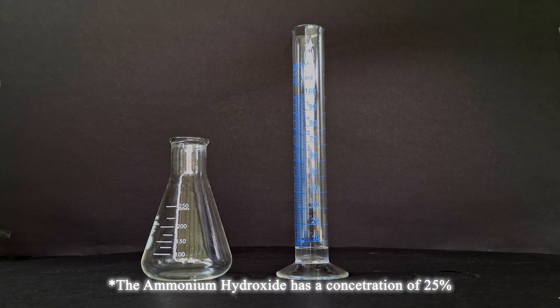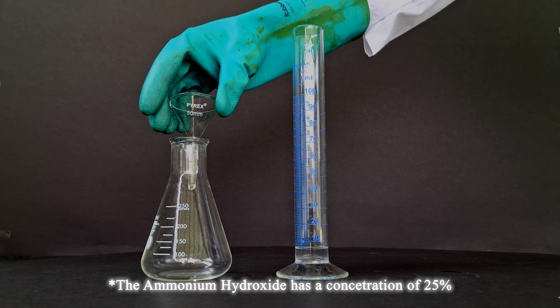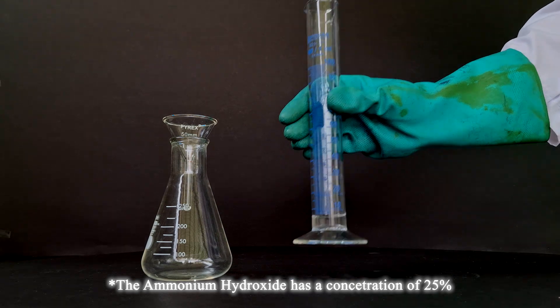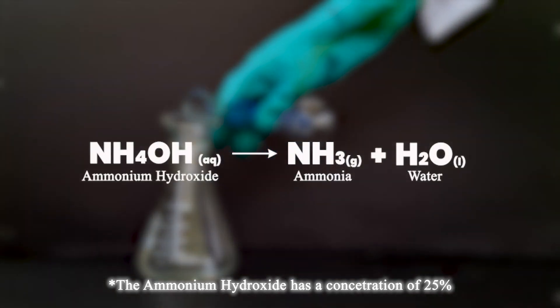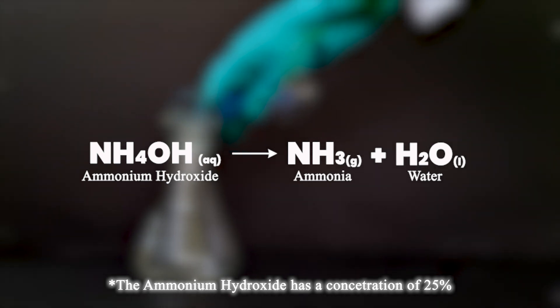But I will still be using the Erlenmeyer, since the amount of ammonia gas produced should not be a problem. The formula for the decomposition of ammonia hydroxide is as follows.